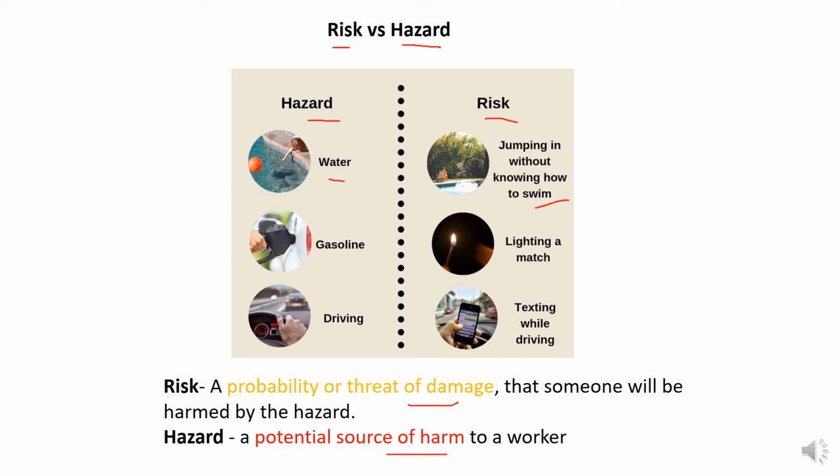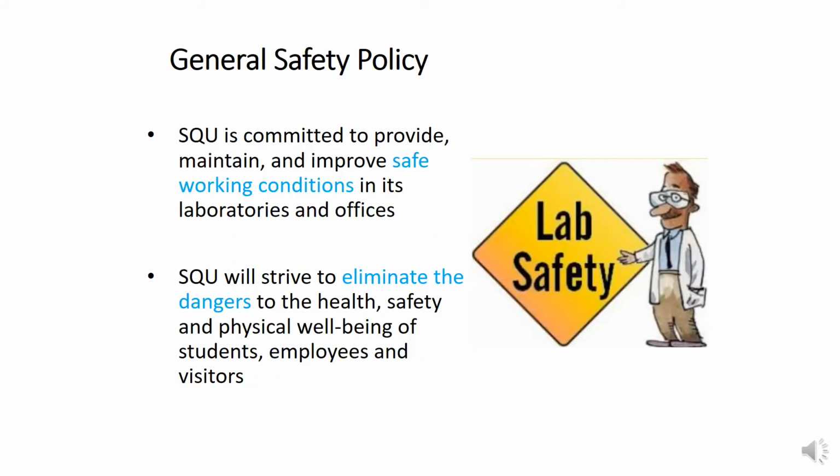You got my point, right? Similarly, gasoline at the petrol pump and lighting a match. If we know the potential risk, then of course we will not light the match. Similarly, if driving is a hazard, then texting while driving is a risk. To avoid this hazard, we don't take this risk. I hope that's a very simple explanation of risk versus hazard.